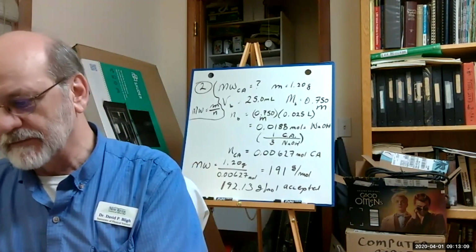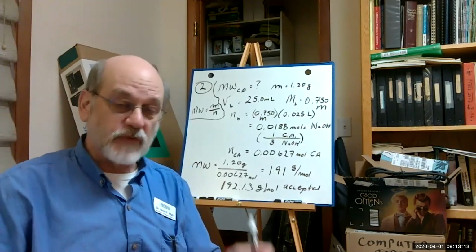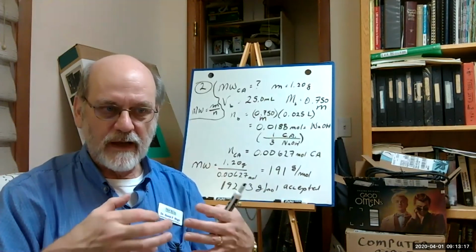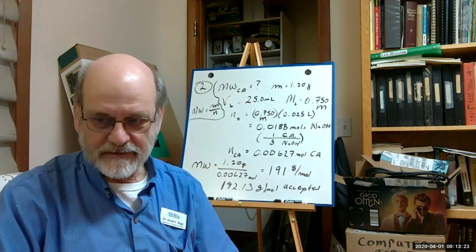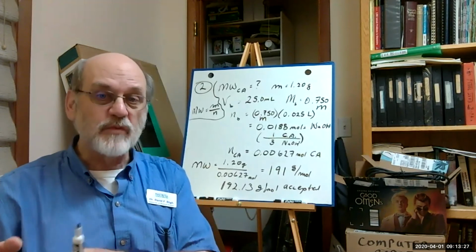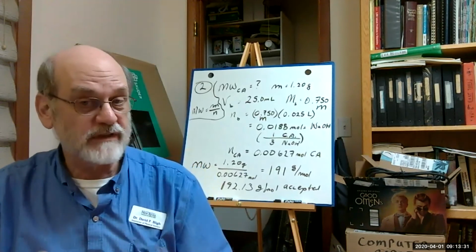But when you generate your report, here's the twilight zone. Imagine yourself as being there, doing the experiment, gathering the data, and then generating the report. So that means you put all this stuff in your lab notebook as if you actually did it.